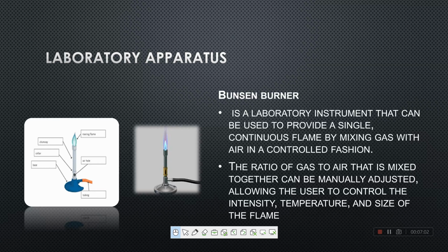Now next one is the Bunsen burner. A Bunsen burner is a laboratory instrument that provides a single continuous flame.